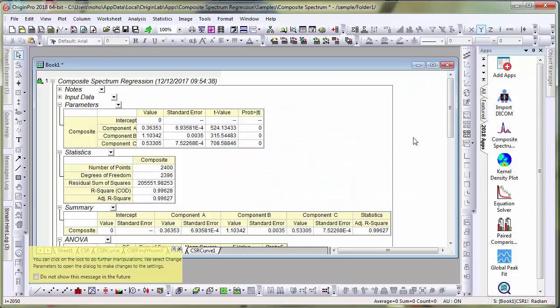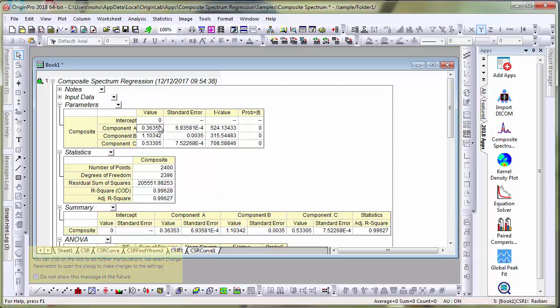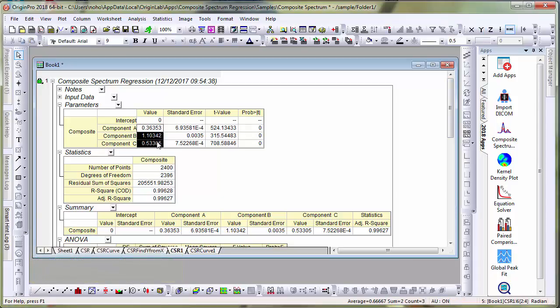And the app will then create a report sheet with the parameters. If you look at these coefficient values for components A, B and C, they will add up exactly to 2.